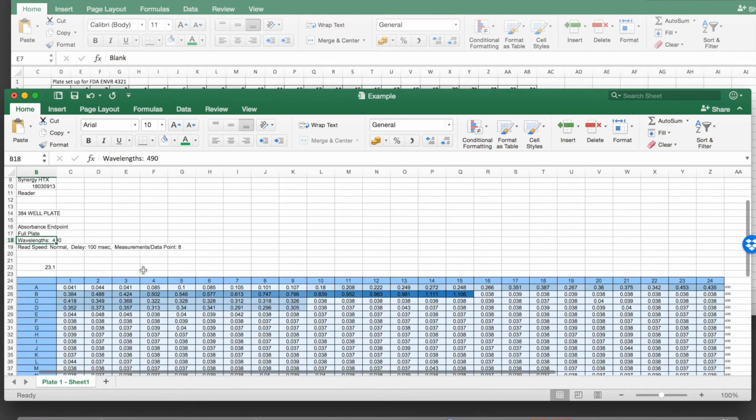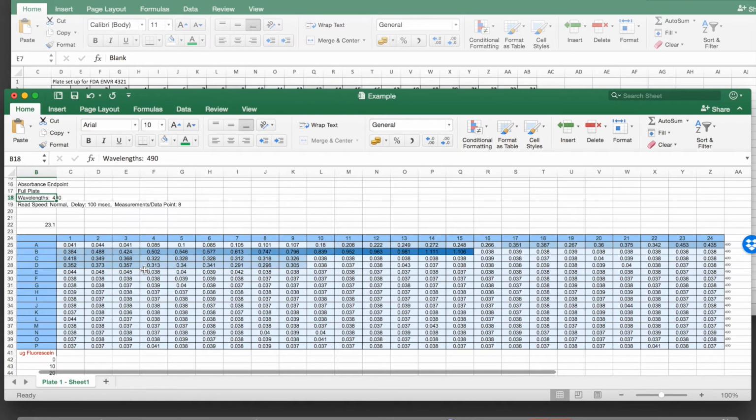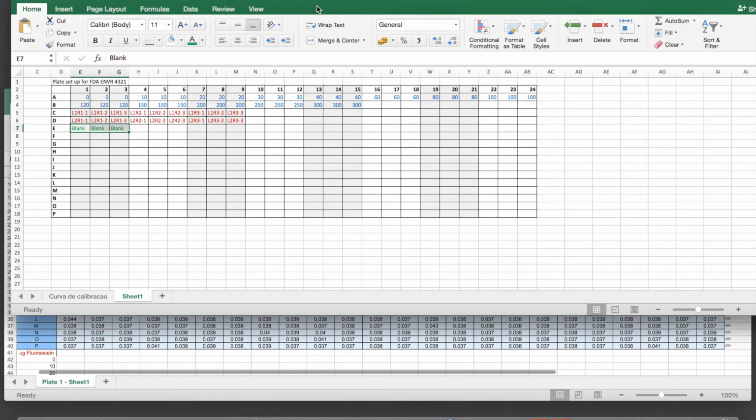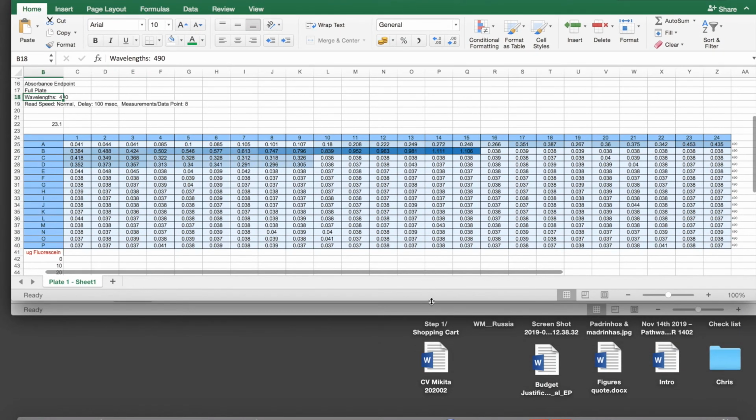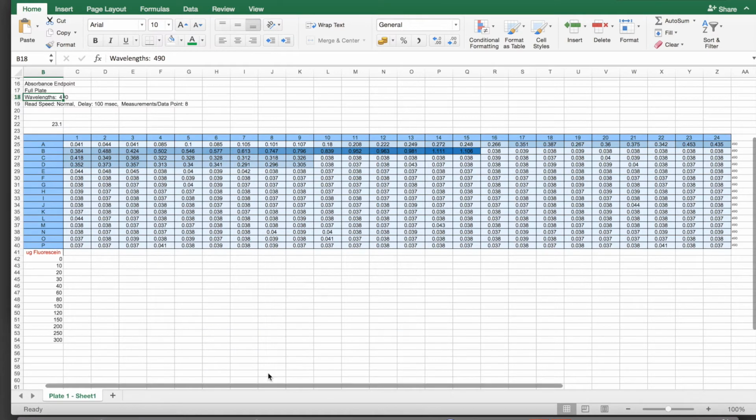I remember they had a very nice standard curve, so I'm using their data, and each group knows how they distributed their samples on their plate. Group 2 used this layout. If your group did a different layout, you should have taken notes, okay? You should have written documentation on this. So this is group 2's data. They're going to have to do their own calculations too.